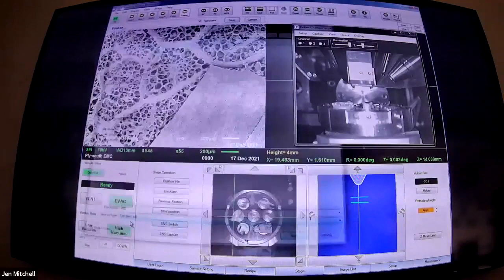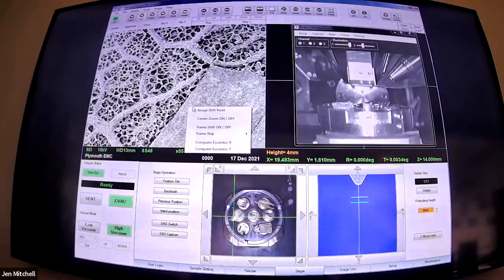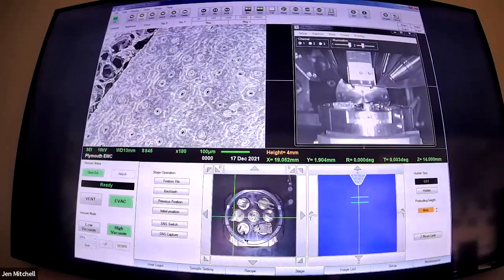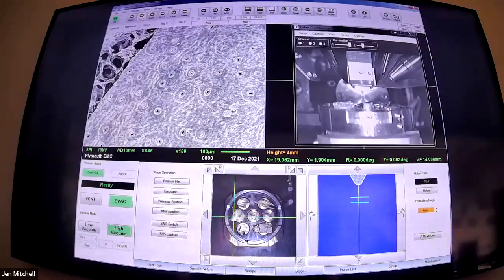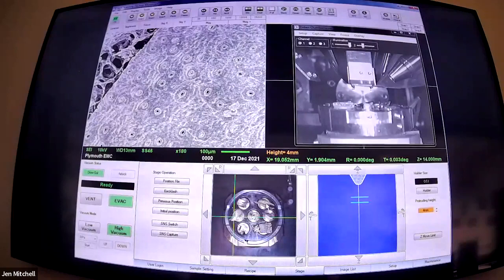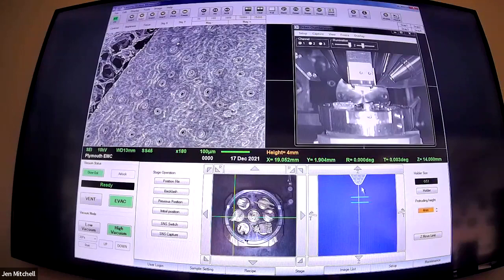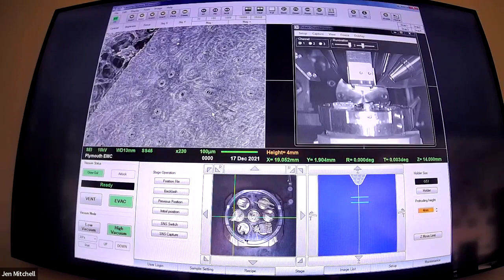If we look at the underside of the leaf, you can see some things that look suspiciously like Jen's Christmas drama. On screen we've got the electron image coming through, and you can also see our sample holder. As we drive around, you'll see this little block moving around the microscope. We've also got a top-down view so we can choose where to go on our sample, which is actually really useful - not all our machines have that. We've also got a little schematic showing us how high up our sample is in the microscope, so we don't accidentally drive it into itself - that's very expensive, and also very embarrassing to get a service engineer out.